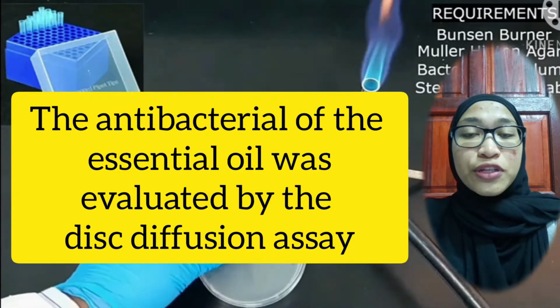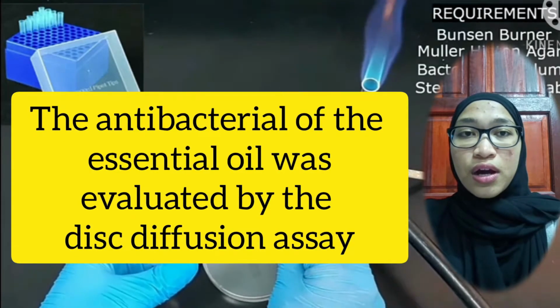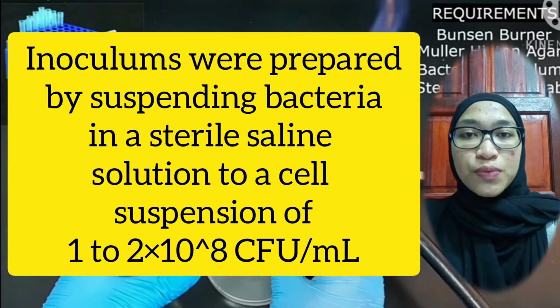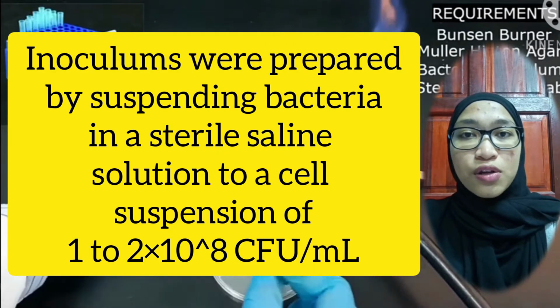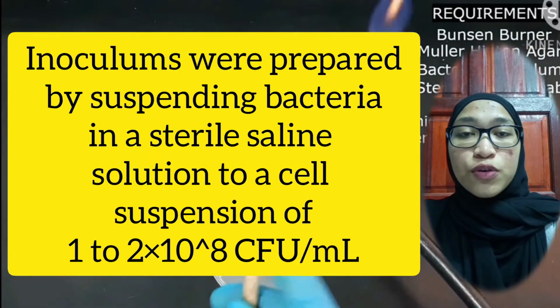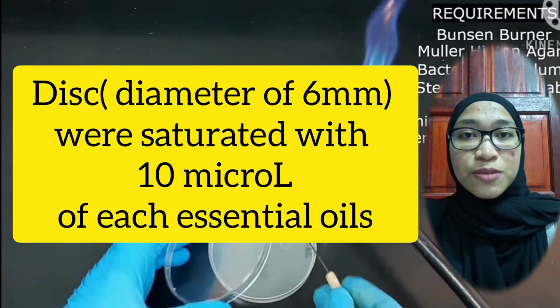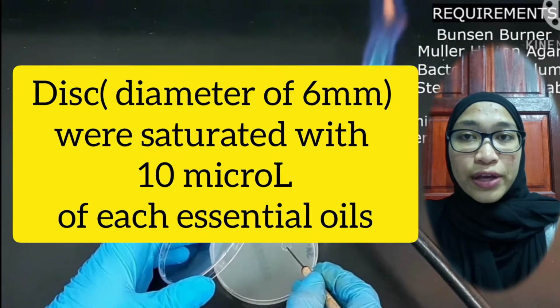The first step for this diffusion assay: the antibacterial activity of the essential oil was evaluated by the diffusion assay. Inoculums were prepared by suspending bacteria in a sterilized saline solution to a cell suspension of 1 to 2 times 10 to the power of 8 CFU per milliliter. Discs with a diameter of 6 mm were saturated with 10 microliters of each essential oil.